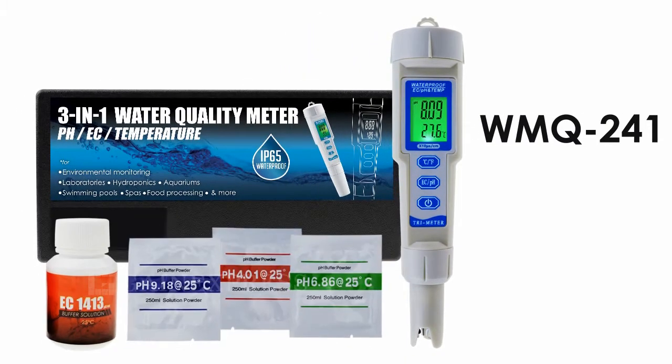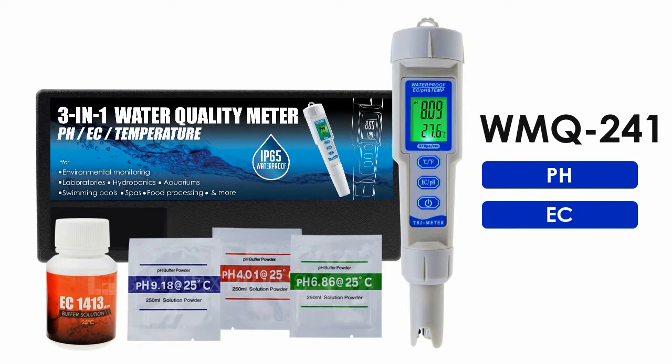WQM 241 is a 3-in-1 water quality testing tool. It can measure pH, EC, and temperature in one unit.